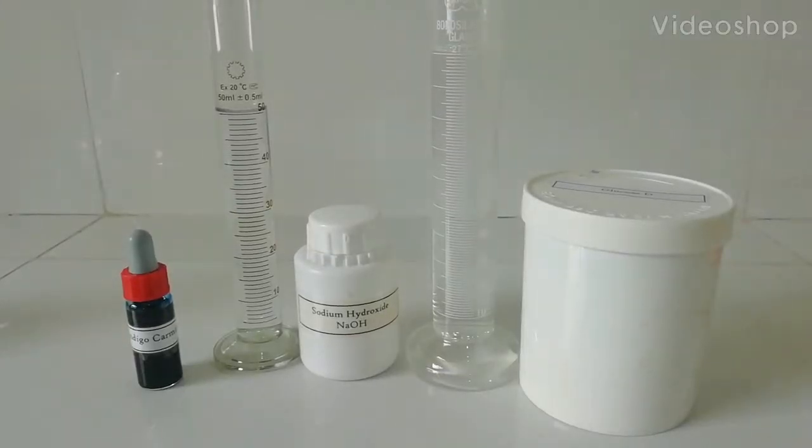In this video I am going to demonstrate the traffic light experiment. For this experiment we need indigo carmine indicator, sodium hydroxide, and glucose. First we need to prepare two solutions. For that I need sodium hydroxide.